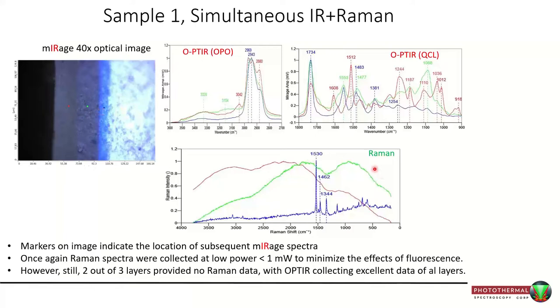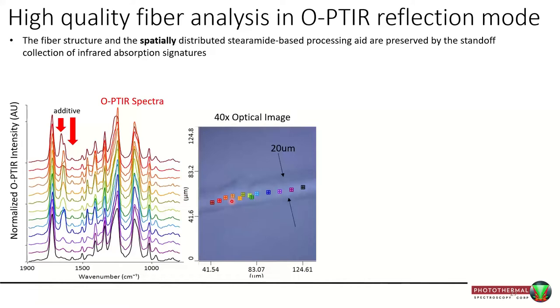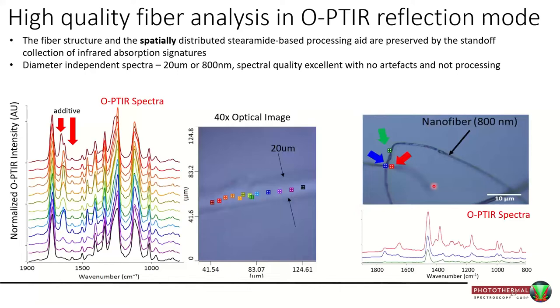A forensic example demonstrates where Raman fails but OPTIR does not: a paint chip cross-section from a vehicle accident, with single point spectra from three different layers. The simultaneously collected Raman showed fluorescence in two of the three layers, making them uninterpretable, while the OPTIR spectra were completely unaffected by fluorescence in all layers. Fibers are also quite difficult with traditional IR measurements, but OPTIR delivers high quality spectra with no data processing — raw spectra collected in real time, showing additives changing along the fiber length, whether it's a 20 micron or an 800 nanometer fiber.